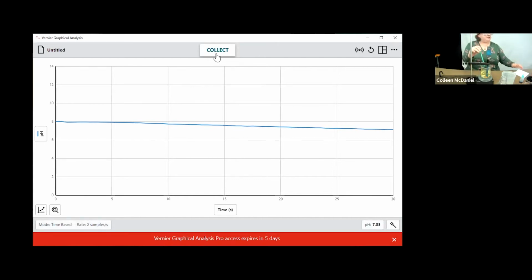All right, so a couple things we can notice. First, my bromothymol blue turned a beautiful yellow color, showing that my pH did indeed drop based on the indicator. And also on the graph here, we can see that I did have a total change of pH and that it decreased. So what we have students do in this activity is look at the beginning pH and then the final pH and subtract them to figure out what our total pH change was. So you can see we definitely had a pretty large decrease of our pH by blowing CO2 in.